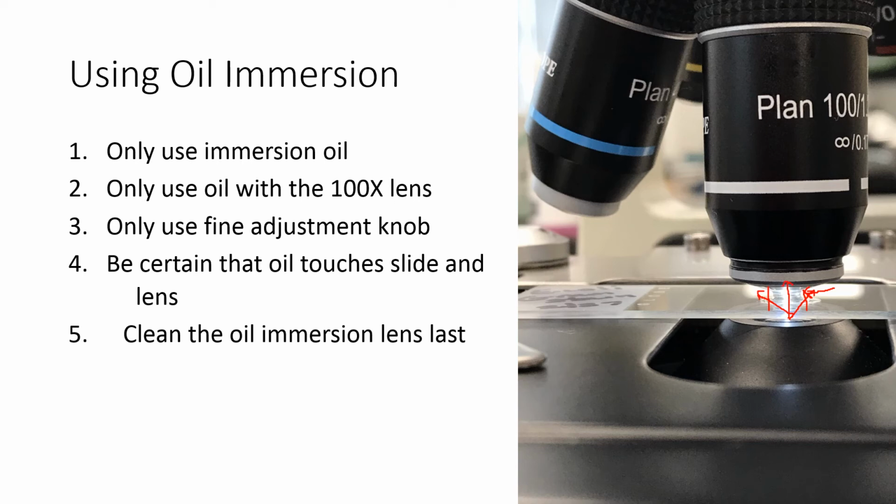So now would be a good time to pause this video and go watch the next two videos in the microscope folder. They will again talk about how to focus on a specimen, even including using the oil immersion lens. And then the second video talks specifically about tips and hints for using the microscope in a microbiology lab. After you've watched those videos, come back here and we'll finish up this presentation.